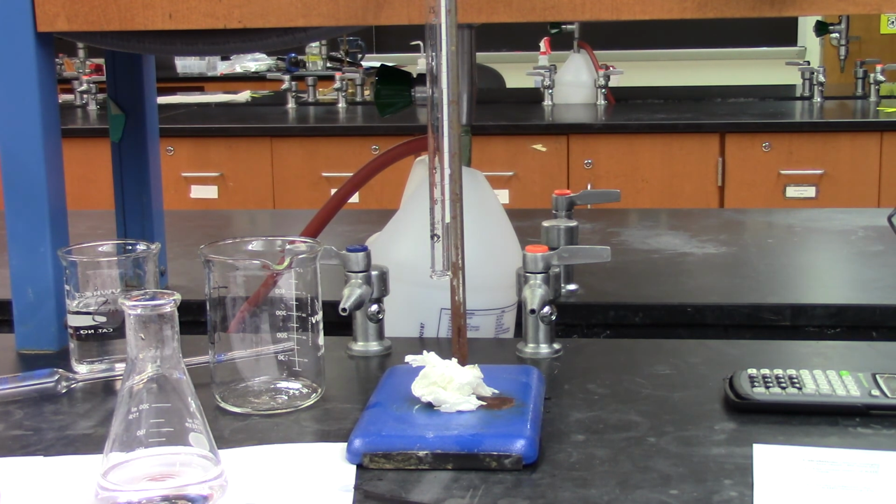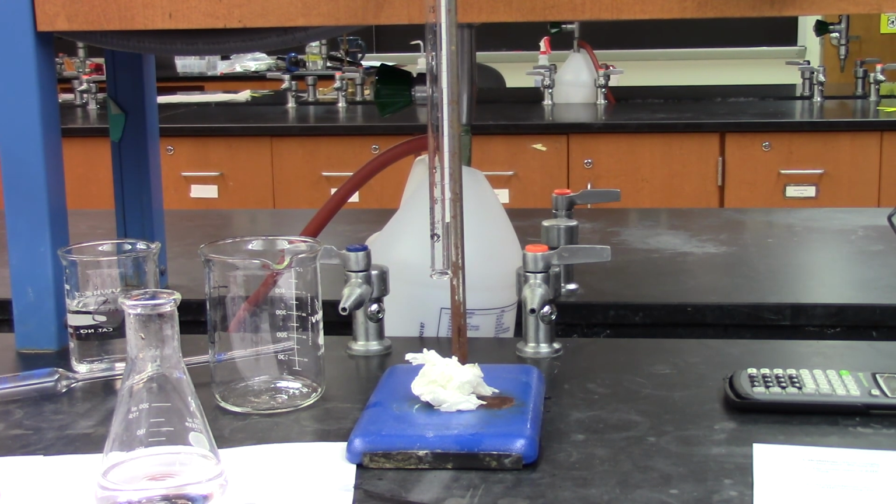Again, your flasks are going to go into the waste beaker to the front. And that concludes the titration video for our standardization of sodium hydroxide.